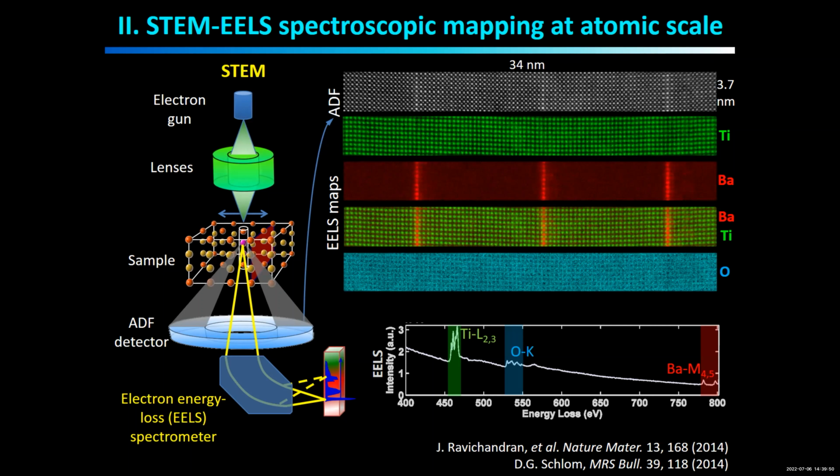Yeah. Okay. So you actually demonstrate that you generate some kind of gas bubble within the TEM. Is it? Mm-hmm. So basically, for this, you're generating oxygen or hydrogen, or what sort of gas are you producing in that chamber? It's oxygen, right?